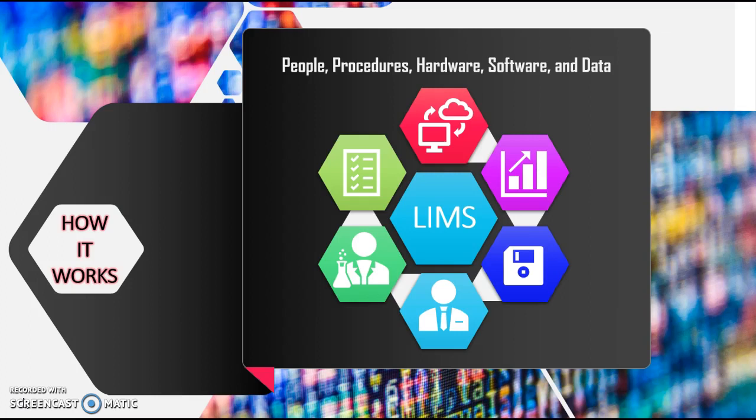One fundamental aim of LIMS is the integration of many different sub-processes, bringing together and consolidating the efforts of potentially many individuals and consequently speeding up the entire process. These systems are not just used as a tool within the laboratory, but also used in order to assimilate the laboratory's outputs with other business systems. This gives management admission to important business metrics and makes opportunities for continuous improvement more obvious. LIMS software works in a multi-layered environment and allows for technical and administrative personnel to efficiently manage job control, quality control and assurance, training, equipment control, and financial tracking.